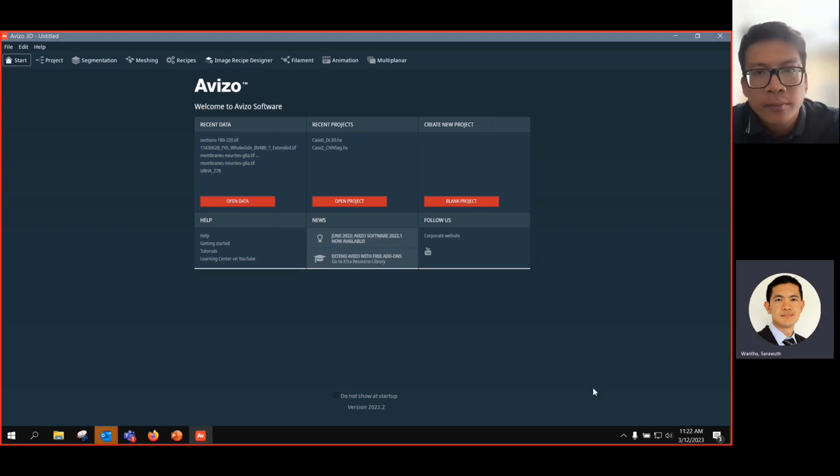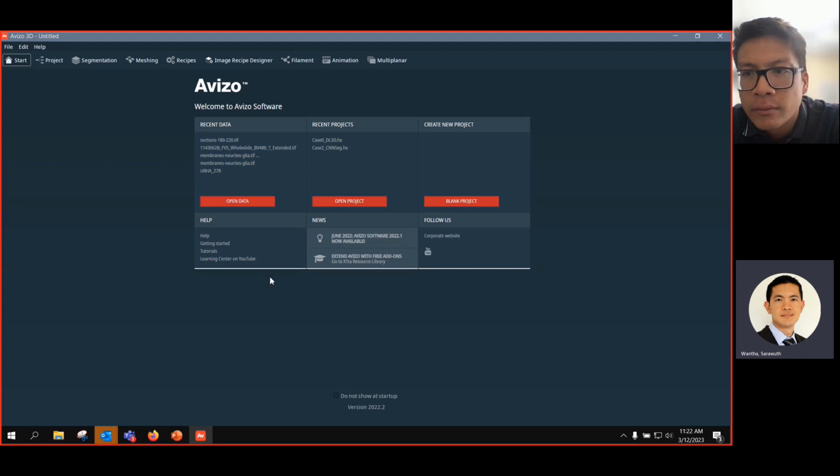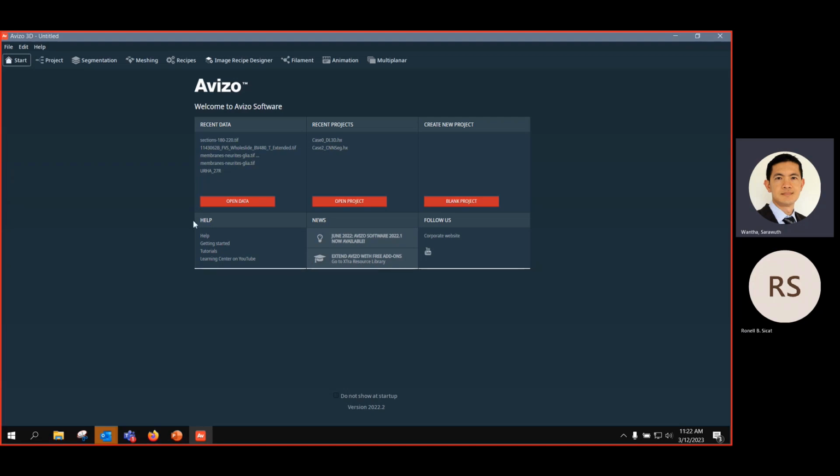So let's start with the live session. We're going to open the Avizo software. You come to this screen. Just let me know if you have any difficulty loading Avizo software, so we can explain a bit and how we can go around with all these functions.